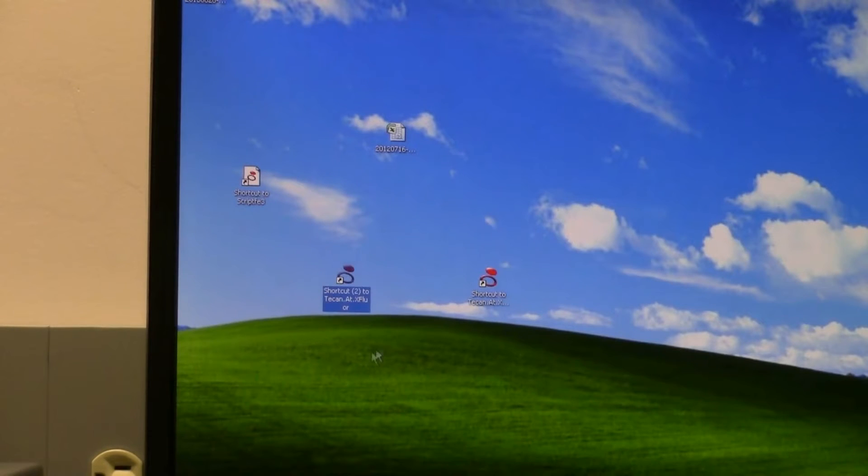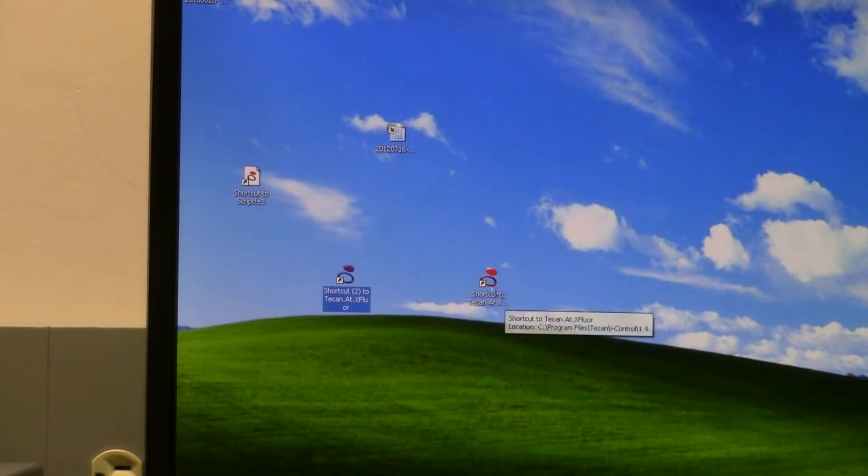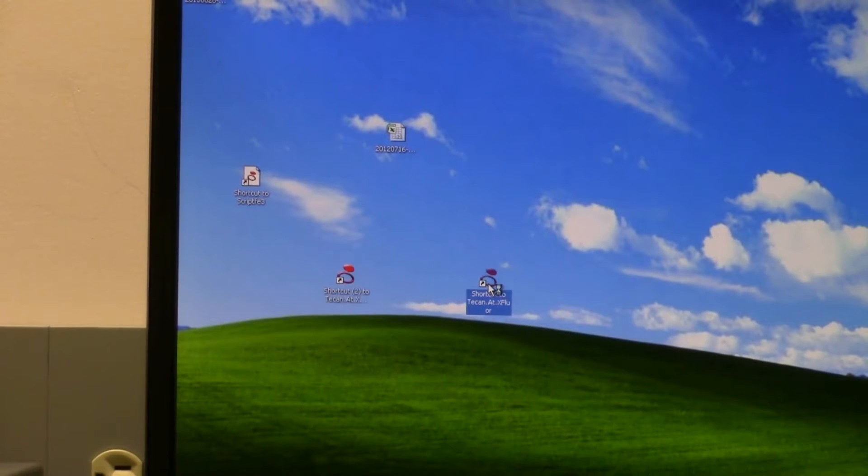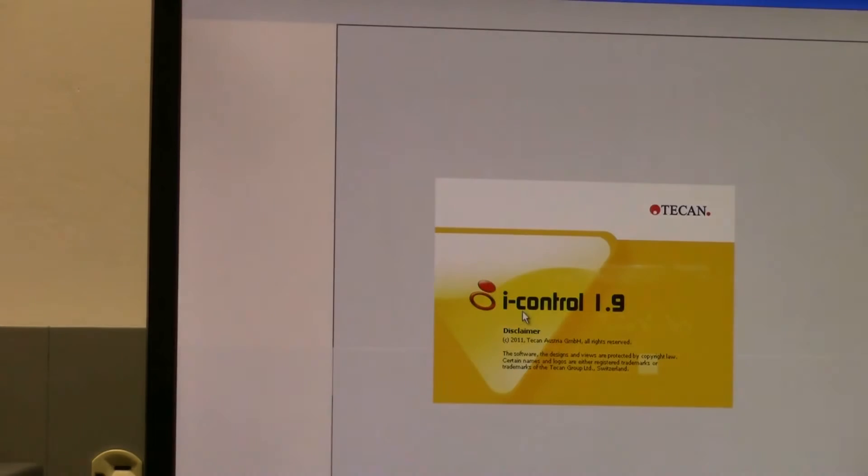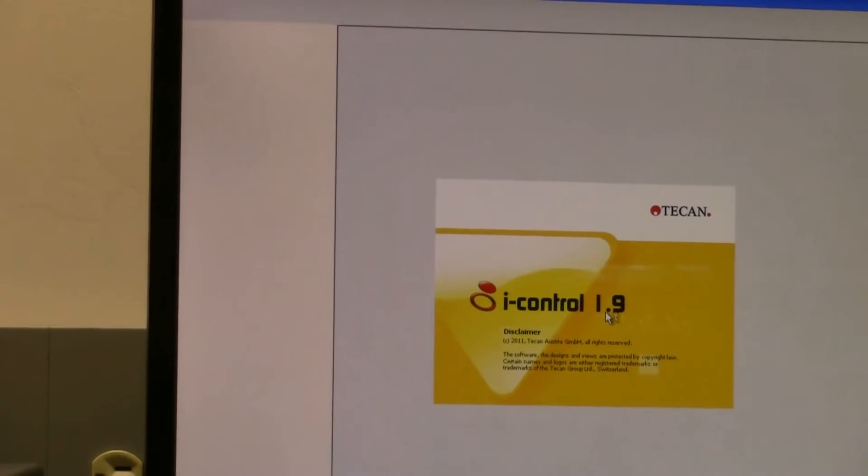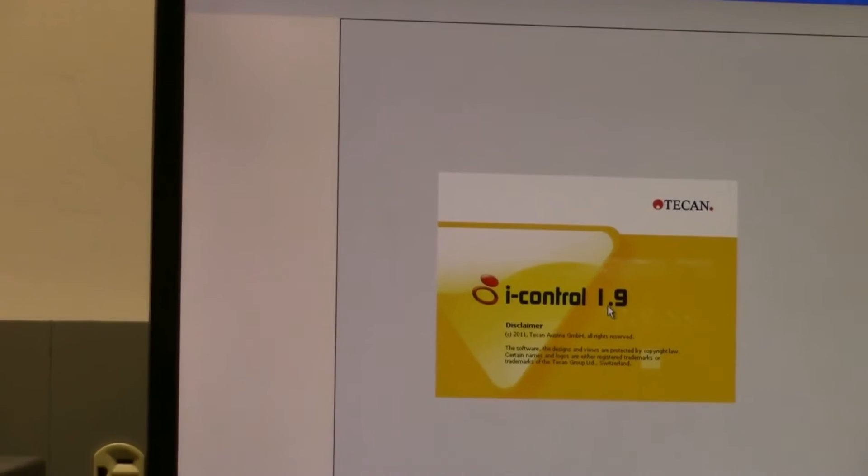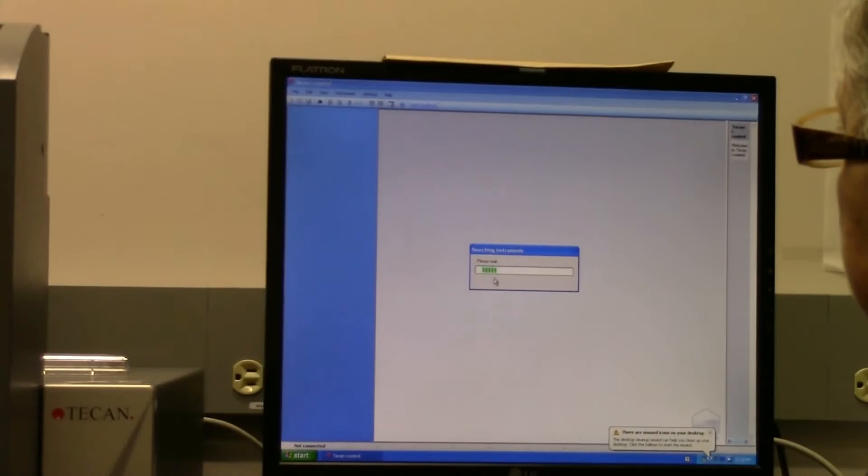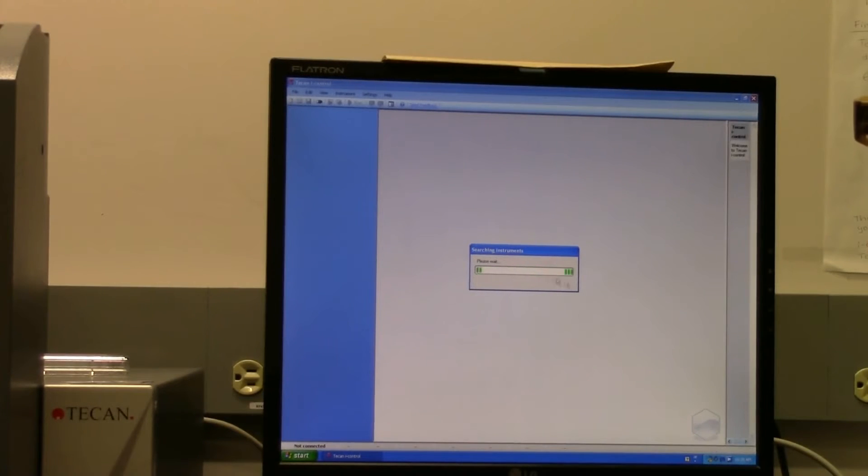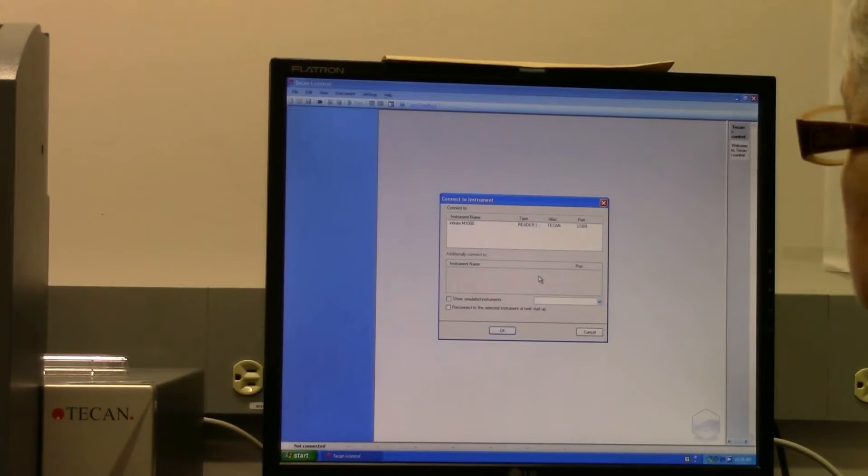And this is what you will use to access the software. So just double-click to open it. It's called iControl 1.9. First thing it will do is search for the instrument, so you have to make sure that you've turned it on.